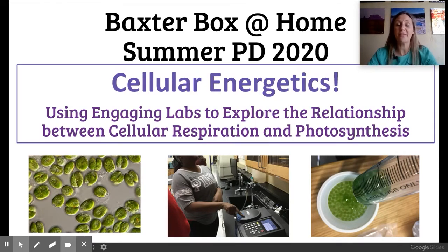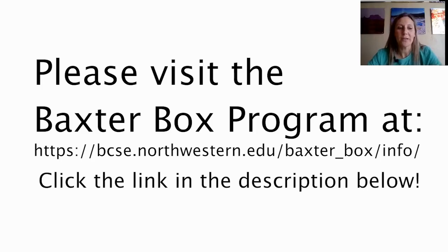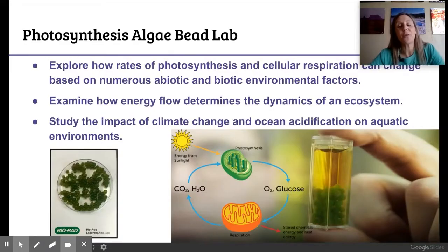We can also beef it up to be pretty intense for some of our higher level kids. We can also run it in a very simplistic manner. I'm going to run through just the basics of this lab with you. Just as a reminder, here are all the labs that you have available to you through this program. The photosynthesis lab. The basic premise of this lab is we are going to look at the rates of photosynthesis and cellular respiration under different conditions.